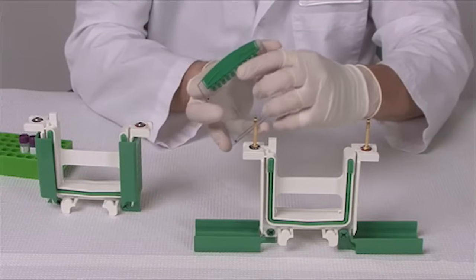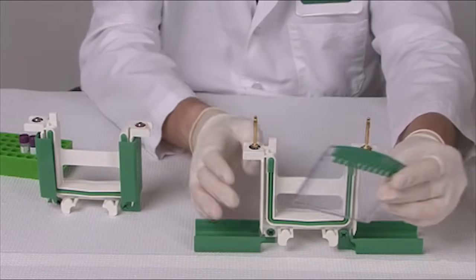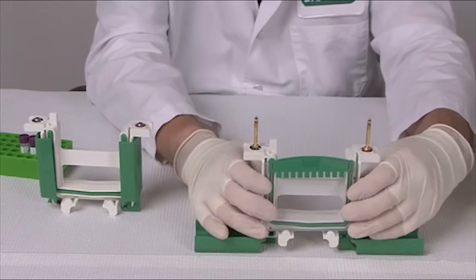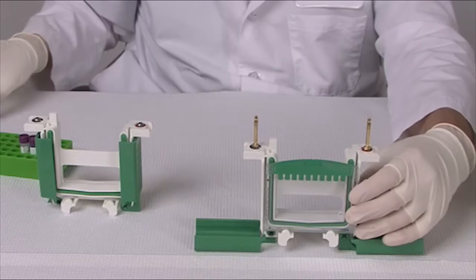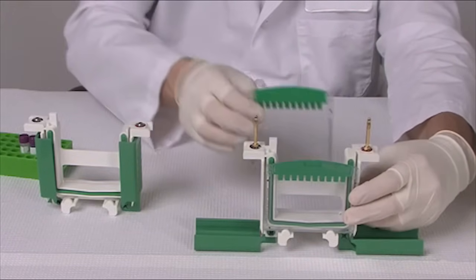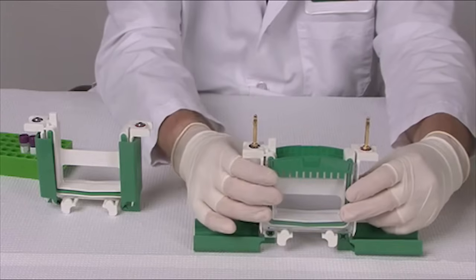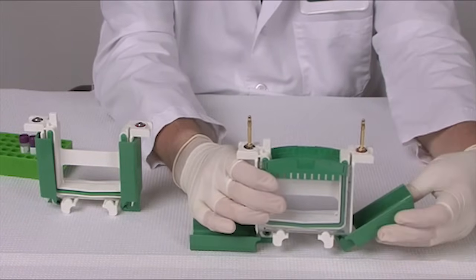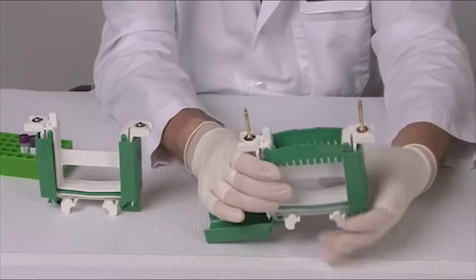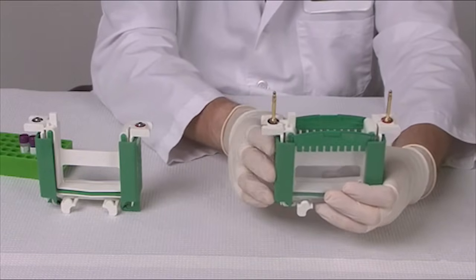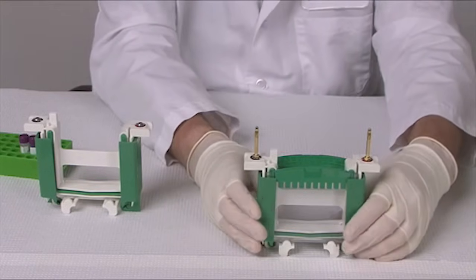Load the TGX gels with the short plate facing inside into the electrode assembly module. Then firmly grasp each wing clamp and close it, one at a time, and when both are closed, you have assembled the electrode assembly module.